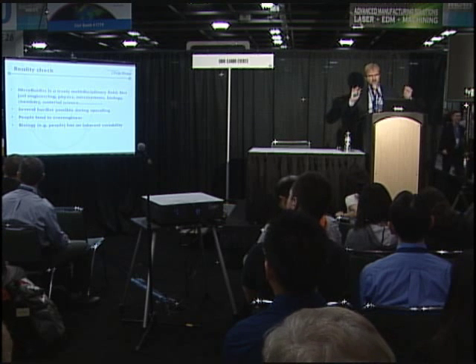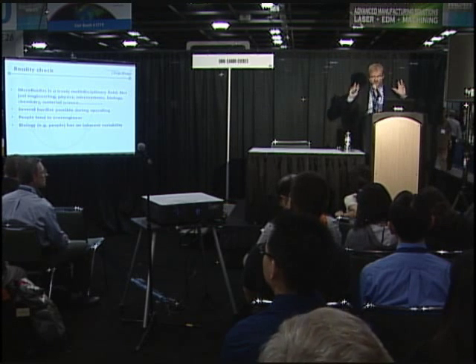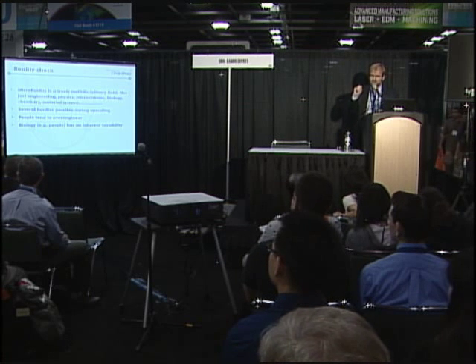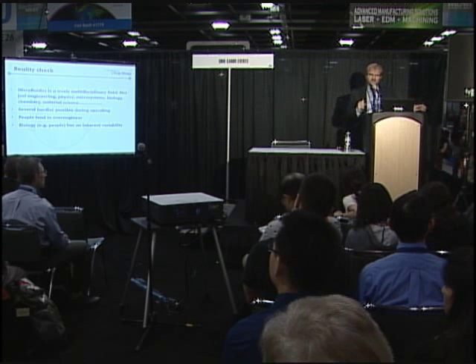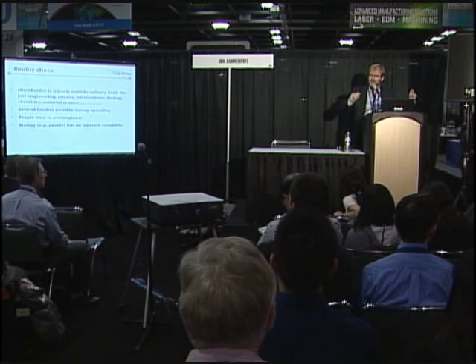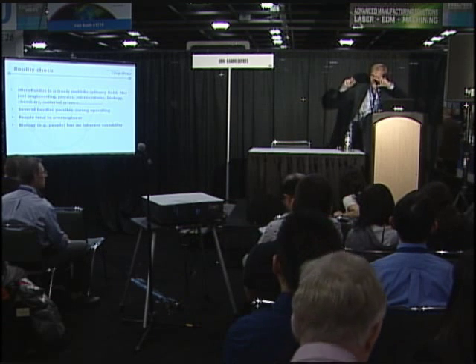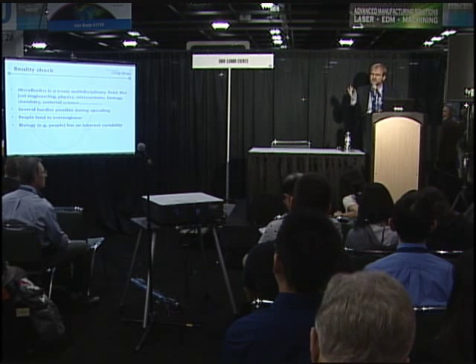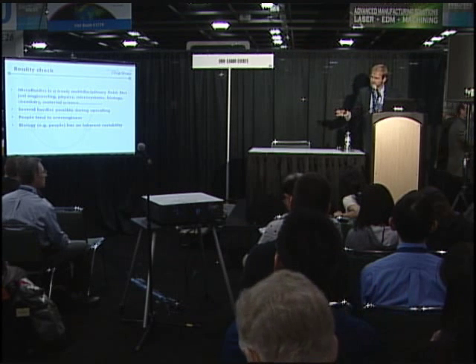There are lots of prototyping methods around where people think, oh, injection molding might be a bit expensive. I will show you later on why that might not be the case. But if you use a different material and a different manufacturing method for your prototyping, and you would then like to scale up and make more parts of it, and you have to switch materials and technology, basically the results you obtain with your prototypes are just for the bin.